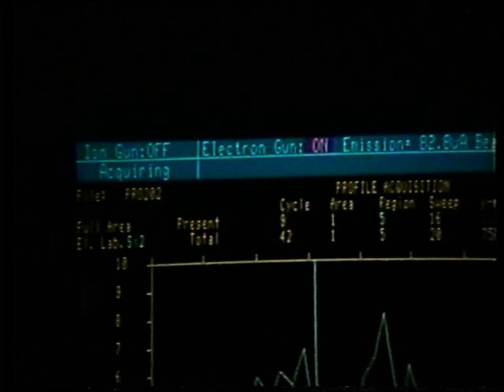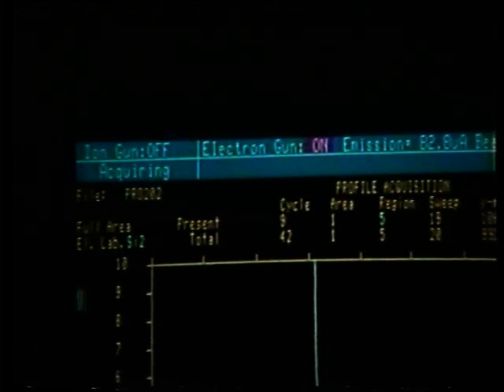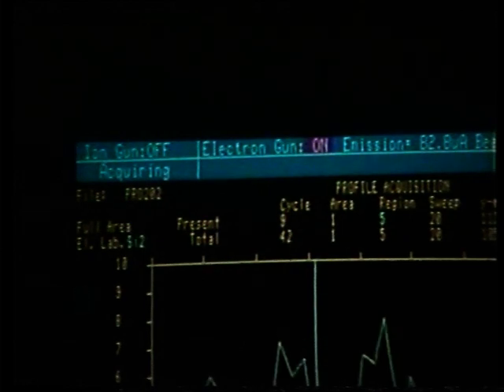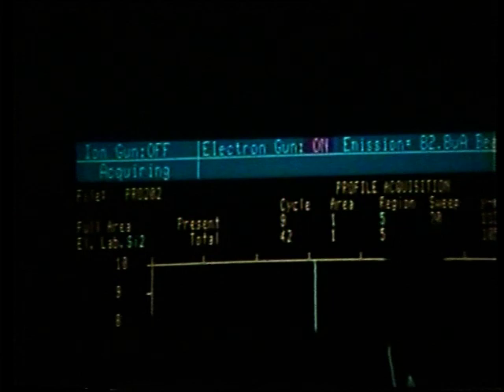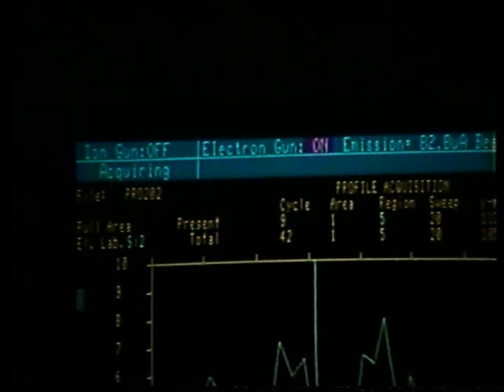It does not display them sequentially because it takes more time to acquire them than to display them. So what we do is we give preference to acquiring the data, and we will then, for example, as we saw here, display sweep number 3, then sweep number 7, possibly sweep number 8, then sweep number 10, depending upon where we can interrupt the acquisition.